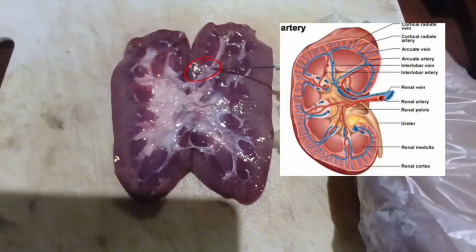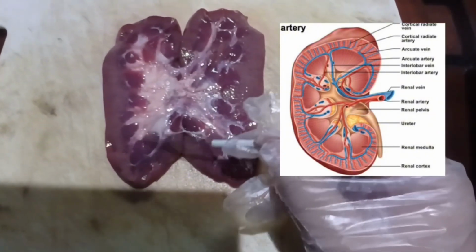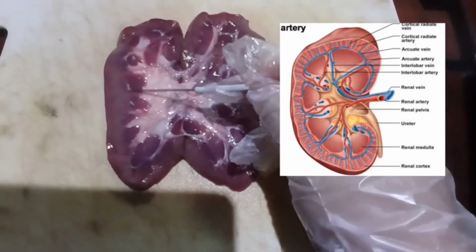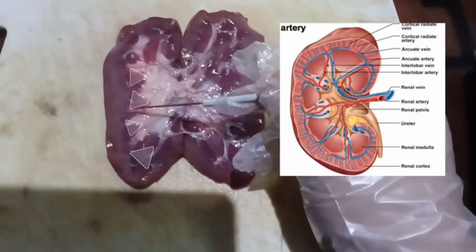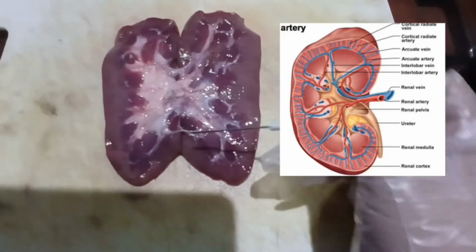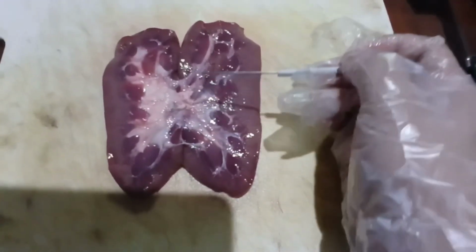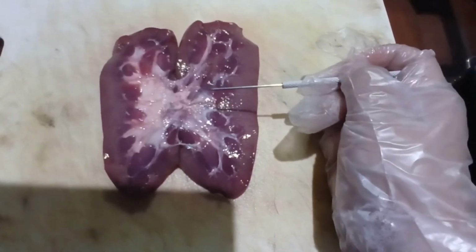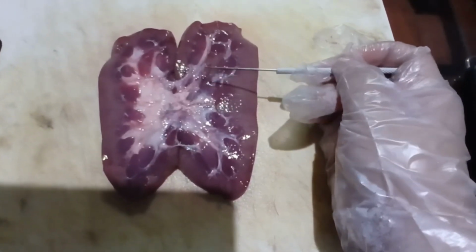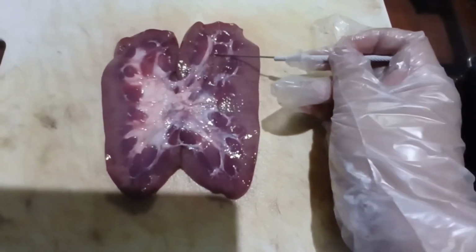The interlobar artery is between the renal pyramids. The renal pyramids are in the renal medulla. You can see over here, this looks triangular. This is what they call the renal pyramids. The segmental arteries branch into the interlobar arteries, which run between the renal pyramids.